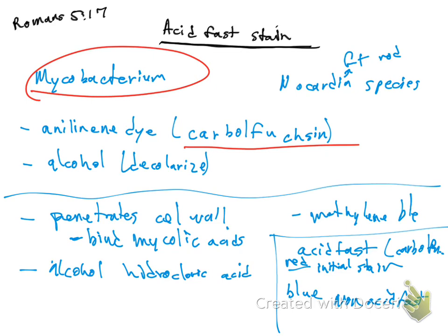So now, last question: between those two, which one contains more mycolic acid? It is the mycobacteria. Okay, and which one contains less? It is going to be the Nocardia. With that in mind, we can know which one is going to have more color and all those things.